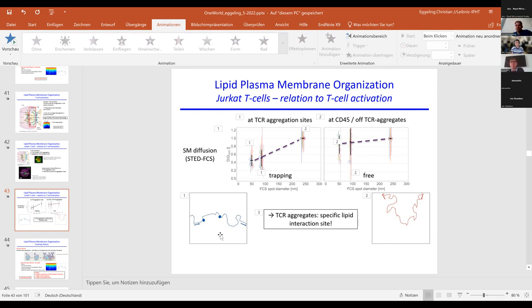That's why people went to scattering objects, because they just hammer out the photons like nothing. And you don't photobleach, so you can follow them forever. And with MINFLUX, because it doesn't try to maximize but tries to minimize the number of photons, it has the chance to get to, as Stefan Hell's team has shown, several kilohertz resolution. But to extract the right time information, the diffusion information, especially at short times, you have to look at the noise and how you consider the noise. Very important. But that's the same with FCS at the short time scales. You have to look out for the noise. Yeah, absolutely. All right.